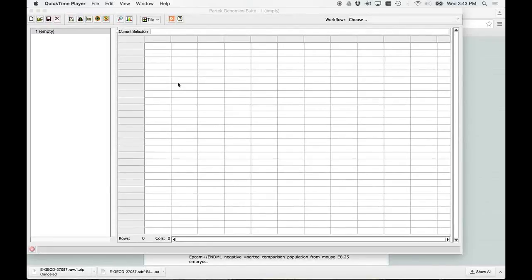Okay, so now we've opened PARTEC. What I'm going to show you, and we talked about the data set that we're going to analyze, the stem cell data set.